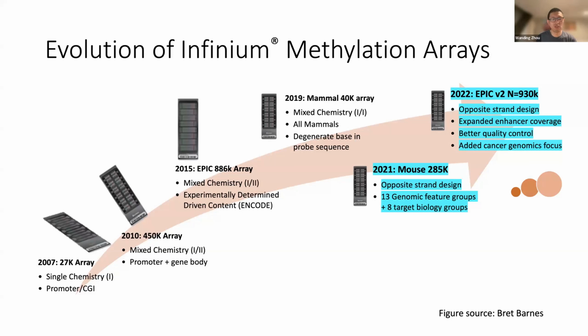So in the focus of this talk, I'm going to cover the last two, the mouse 285K array and the EPICv2 array, hoping to give everyone updated knowledge of some of the novel designs, content changes and other technical aspects.